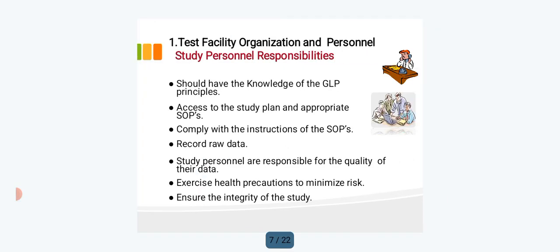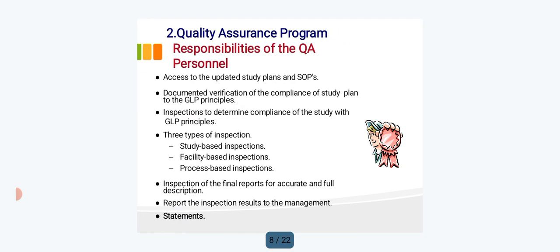First, the test facility organization and personnel. We collect the personal details such as names, and the raw data is recorded. The personnel are responsible for the quality of the data, exercise health precautions to minimize risk, and ensure the integrity of the studies. And second, quality assurance program.